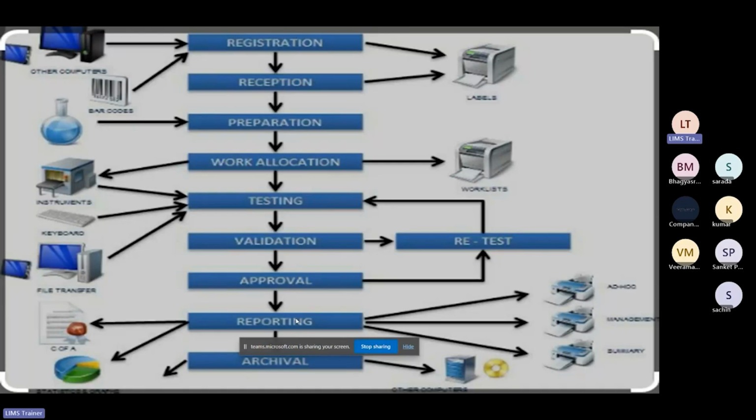Why is the archival part important? Can anybody tell me? Why is the archival part important? What do you think? Anyone?